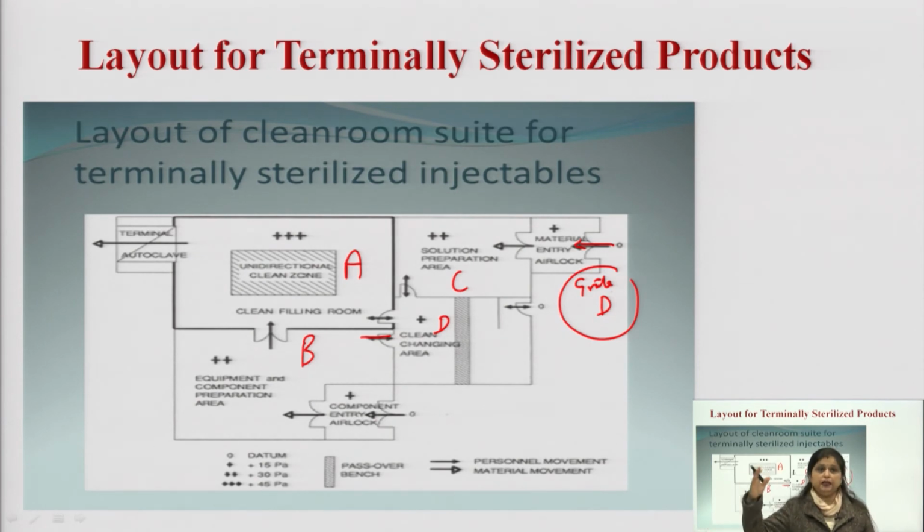When we move from the normal lab towards the aseptic area, the whole lab will be categorized into 4 areas. First, we have to move from D to C. The movement must be unidirectional, that means we have to move from D to C, C to B and B to the aseptic area. We can't go from A to D directly. What we need to do is first go to the microbial lab. In the microbial lab, you have to clean your hands and put on new lab coats, since D class is a highly contaminated area.